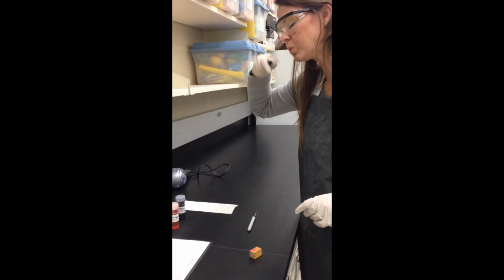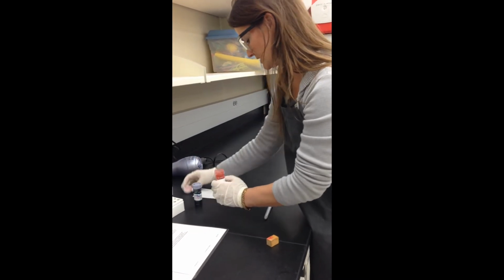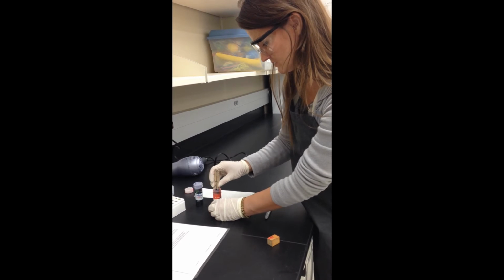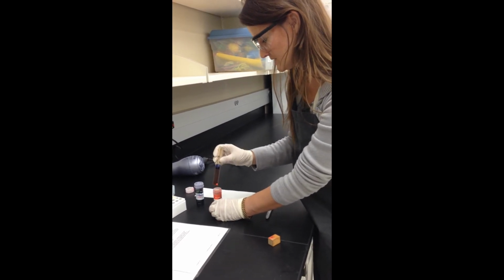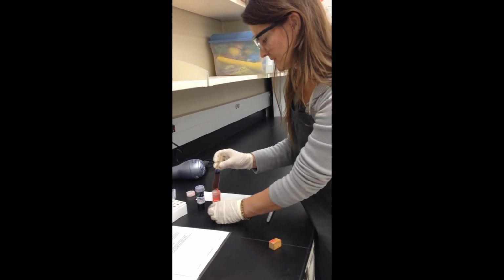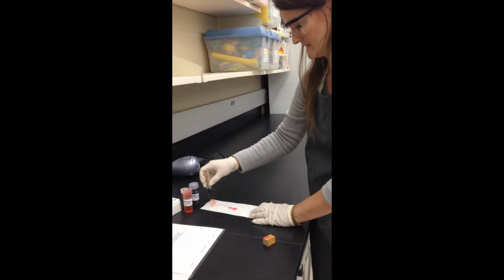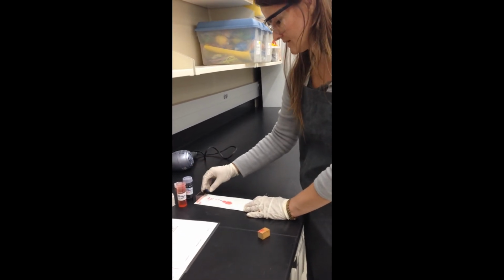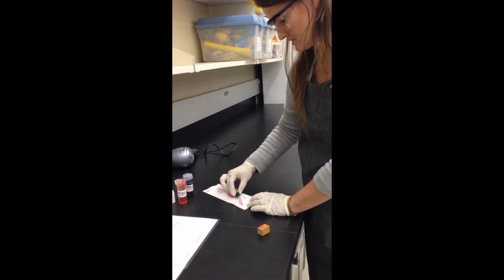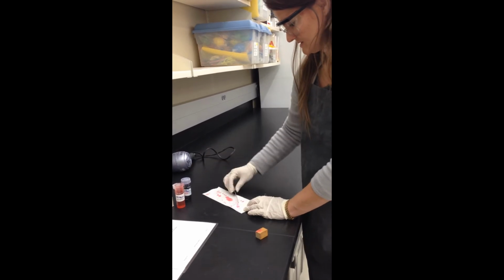Okay? That looks pretty good. Okay, so we'll open here and dip once. The directions tell you for 1 second only, and repeat. Once you repeat that, your directions will tell you to drain off your excess stain. So you have a paper towel here that you can angle your slide around and try to get a little bit of that excess stain off of there.